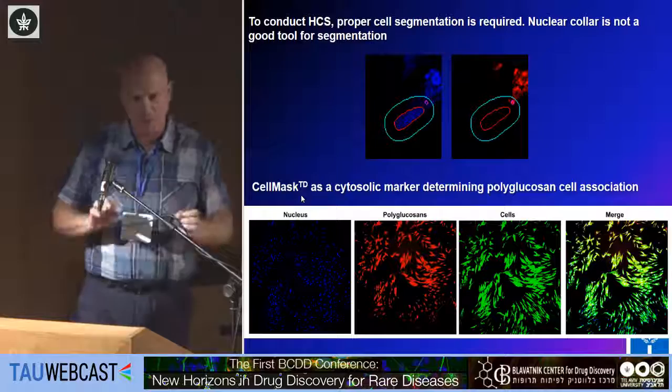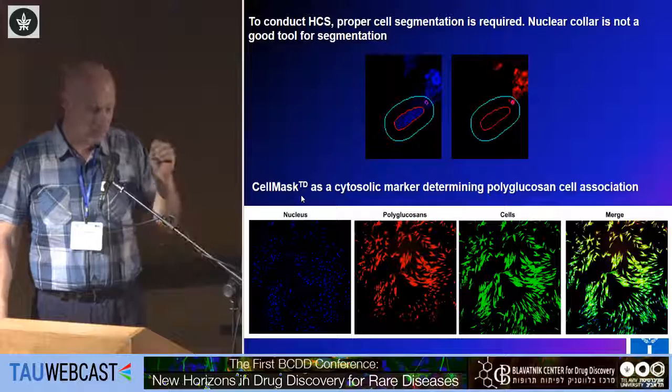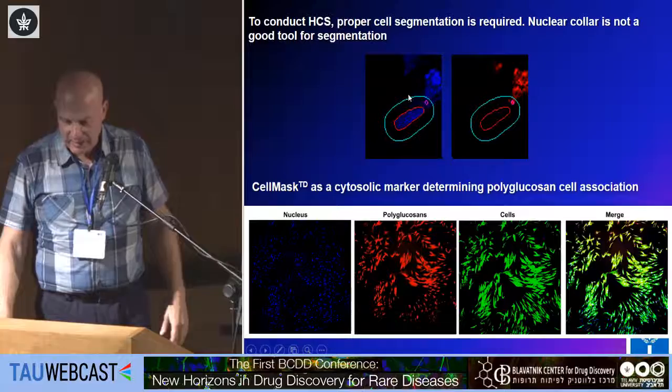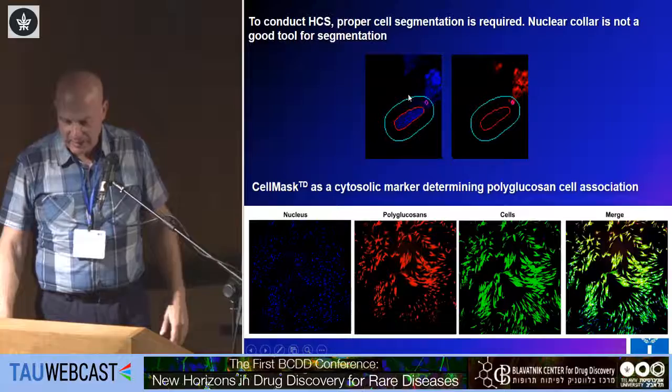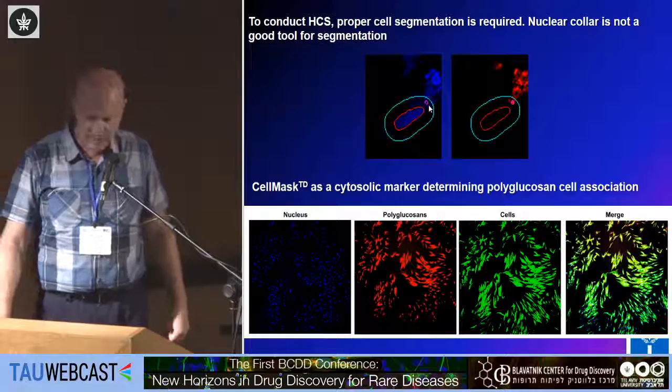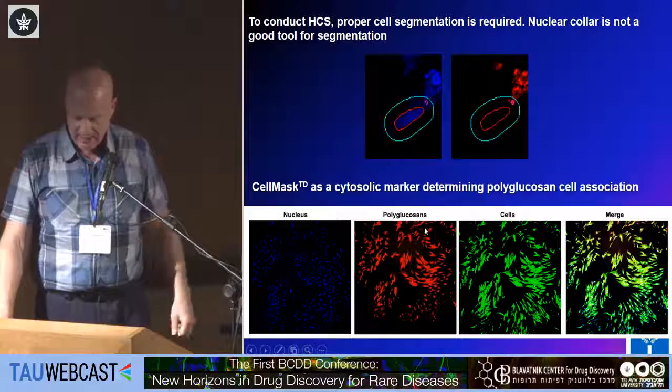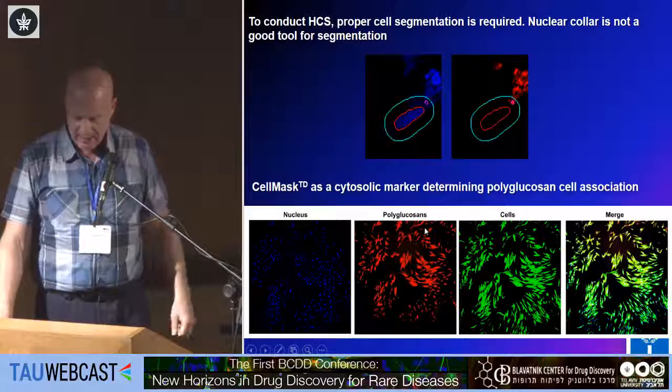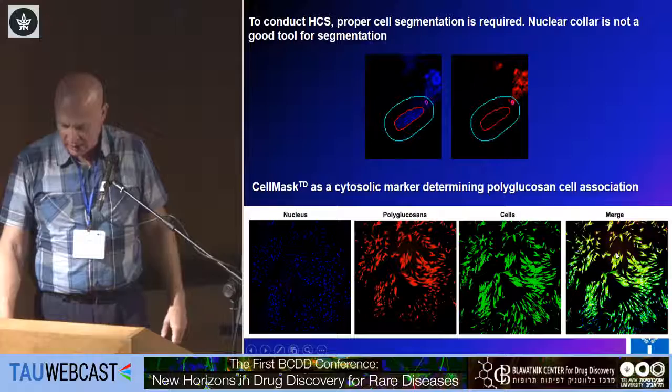One important non-technical point: you want to make sure your readout is what you intend and that you are looking at the right entity. For instance, we use segmentation. The classical segmentation is based on the nuclear collar, which can include extracellular debris as part of the cell. Instead, we use the cell mask, which stains the cytosol, and you can see that all the polyglucosans we identified are actually cell-associated.